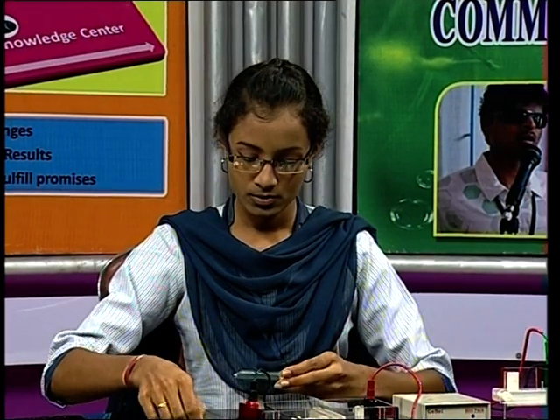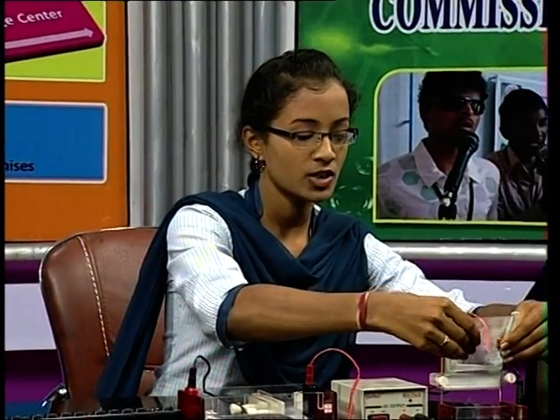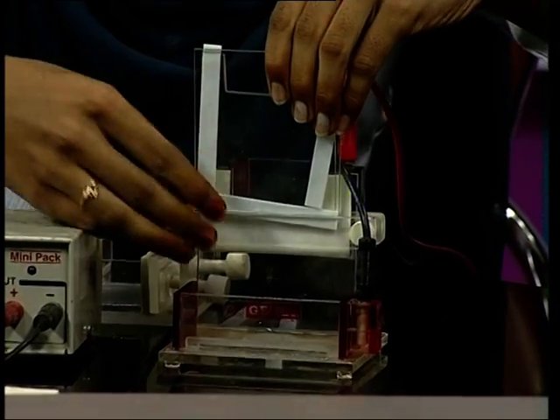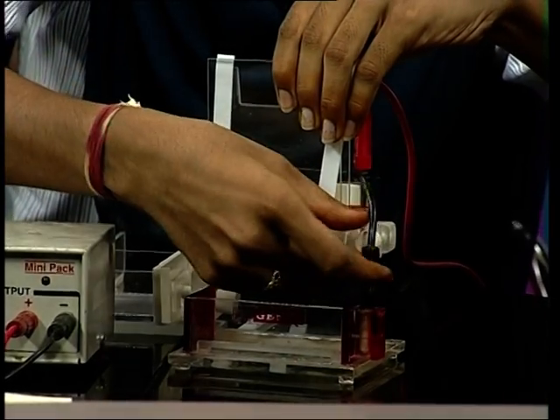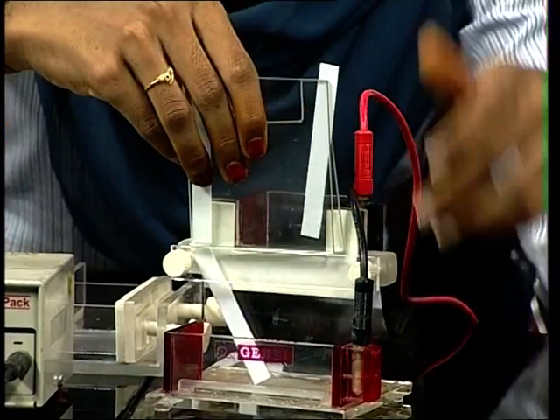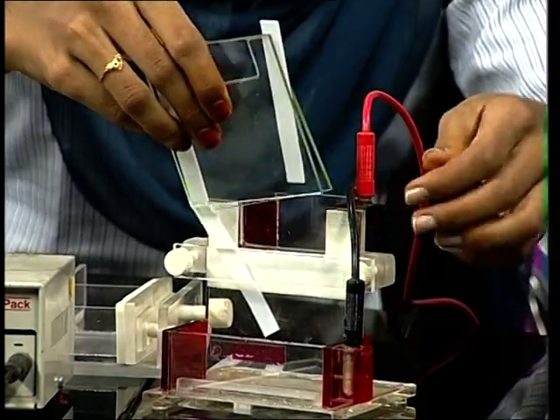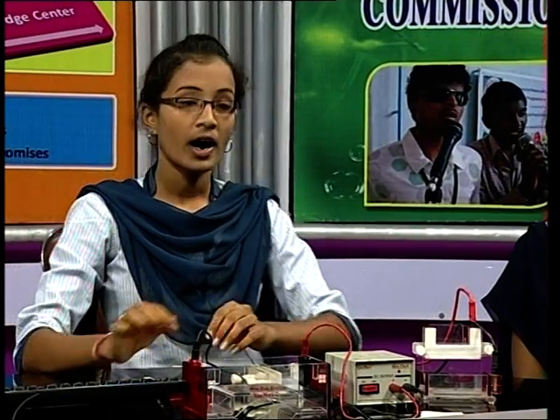And for the apparatus, after the preparation of the sample, we have to place the gel plates in the electrophoretic chamber. And here also the separation is based on the molecular weight of the proteins. And the last one is the detection.